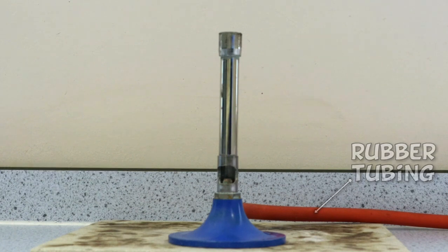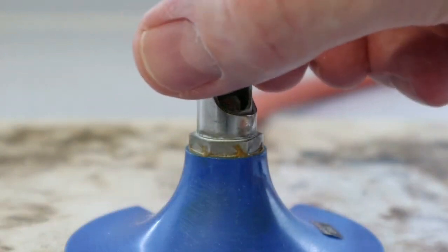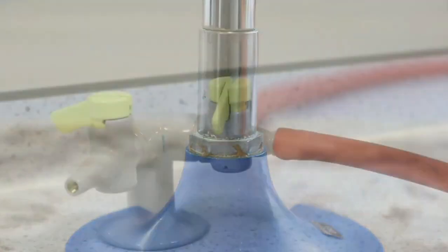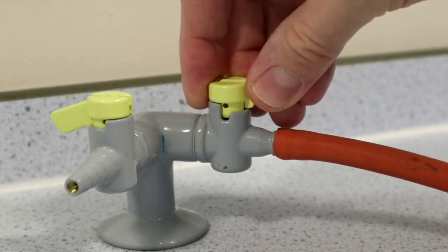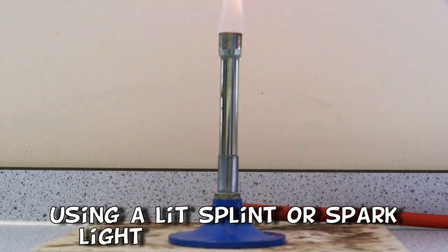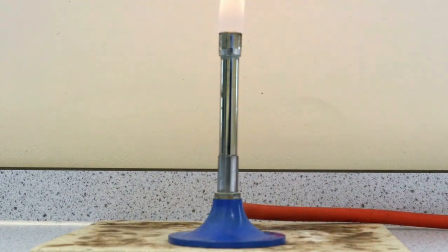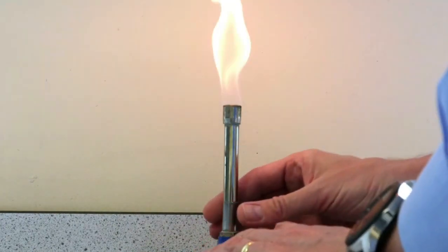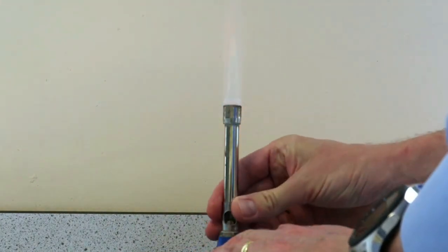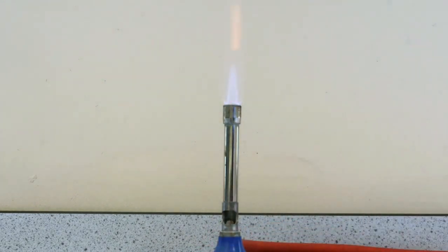To light the Bunsen burner, we should first close the air hole completely. We can then turn on the gas tap, light a match and hold it at arm's length above the top of the Bunsen. You should also be standing up with long hair tied back and any flammable materials placed well out of the way. Now you'll see that when I open up the air hole, we get a very different flame. It changes from yellow to blue. Let's look at the two different types of flame in more detail then.